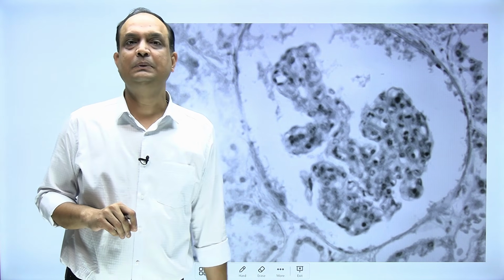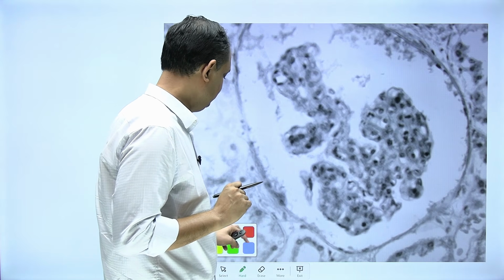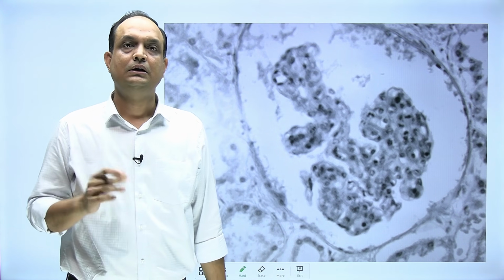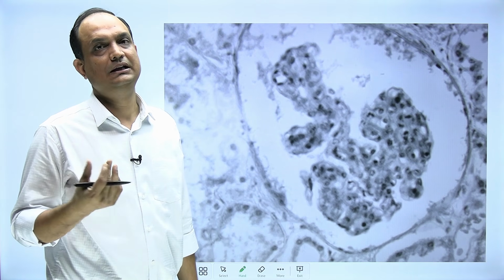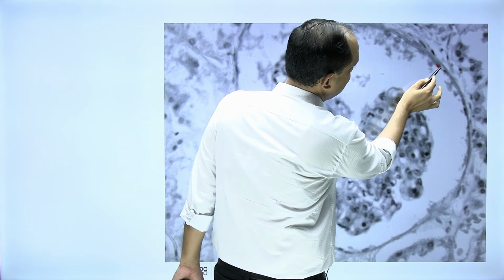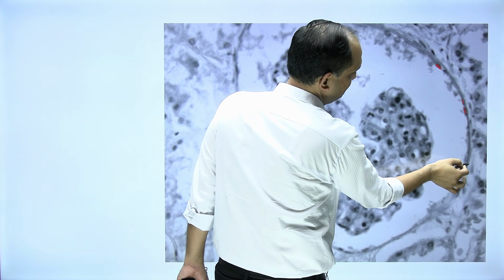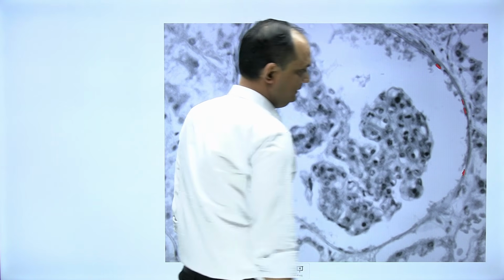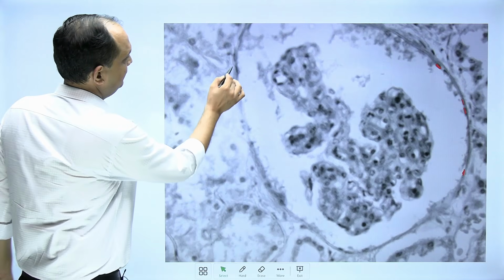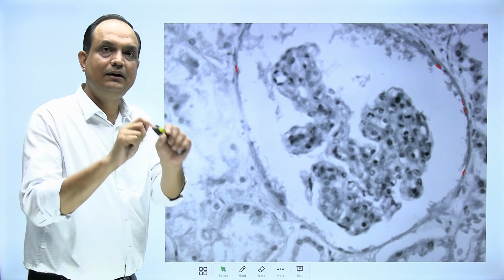Now here I will explain one more example of simple squamous epithelium. In this diagram, this is a black and white shadow, or the diagram, of your kidney. In the kidney you have the Bowman's capsule, and the lining of Bowman's capsule is simple squamous epithelium. Here you can see the cells lining the Bowman's capsule, and again the cell thickness is not more than a line. If you examine this inner line very carefully, you will find that these cells are flat.